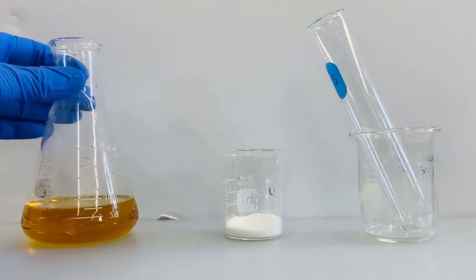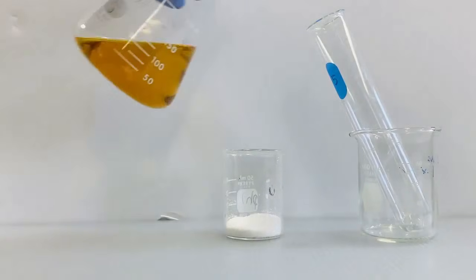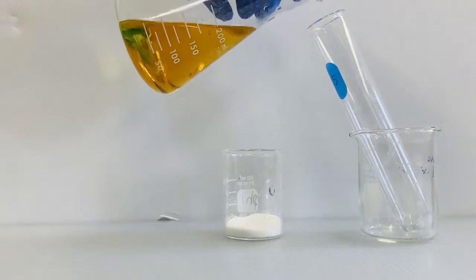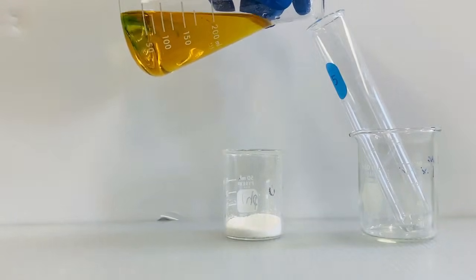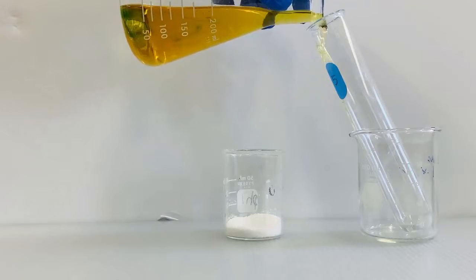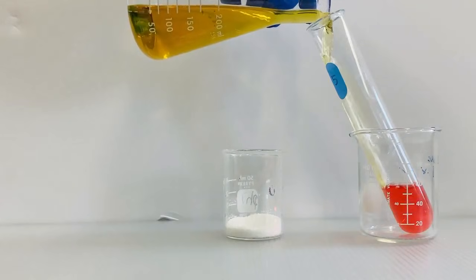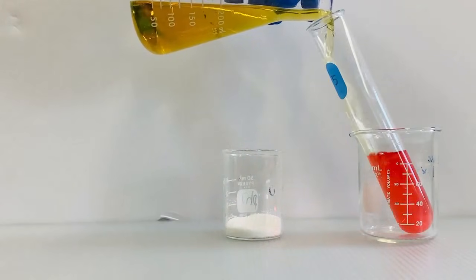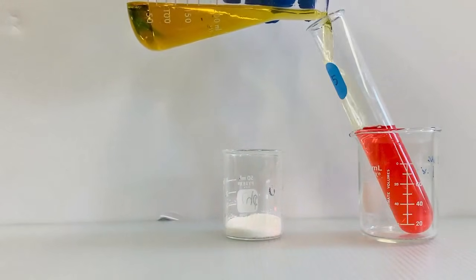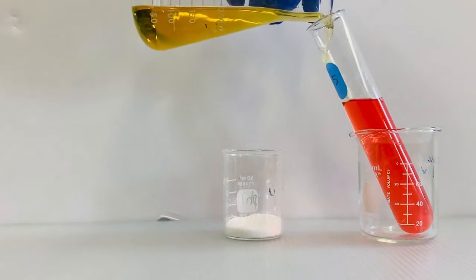We're now ready to understand all the color changes that we saw in the experiment. The fluid appears yellow at first because the thymol blue is in the presence of water and alcohol, which are both neutral. When the mixture is poured into the test tube, it turns red because there's drops of strong acid at the bottom of the test tube and thymol blue is red in an acid.